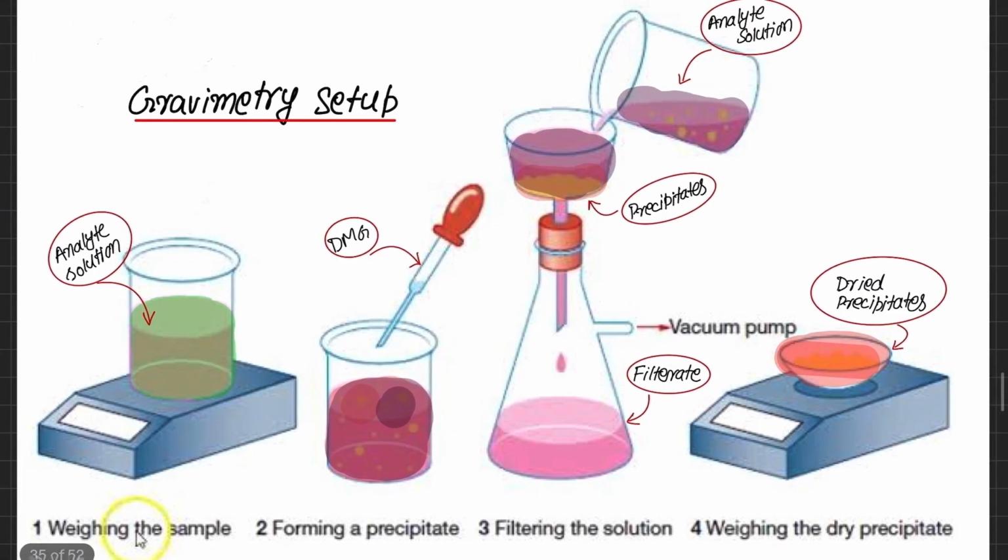So this was the whole experimental procedure and setup for gravimetry, which has been explained in this lecture. I hope you have understood this lecture, but if you are still feeling some confusion or have some queries, do let me know in the comment section.